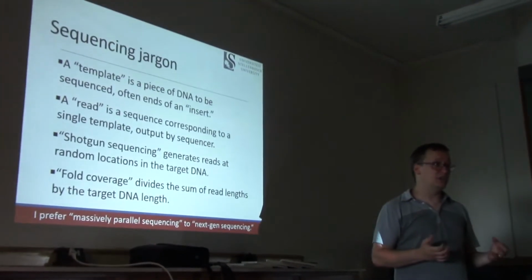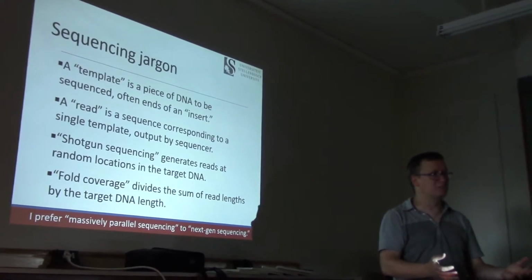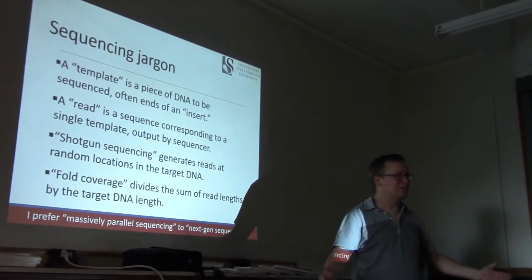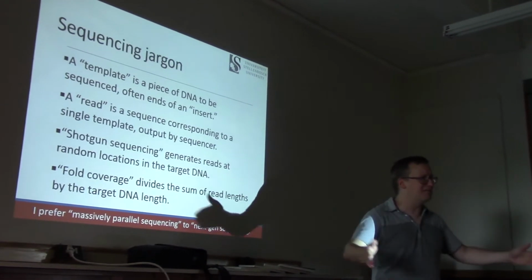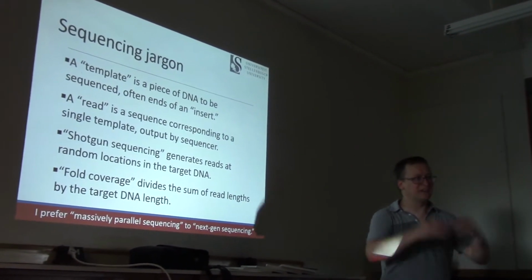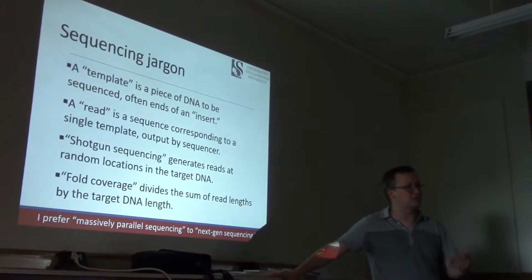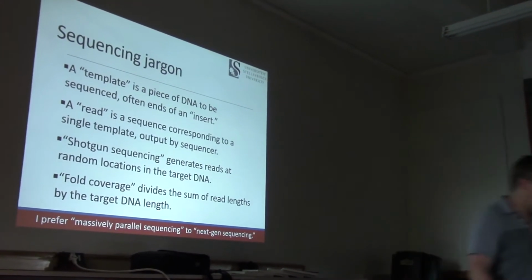That's not very good, because if you do only 2x coverage for an organism, you are not going to have a complete end-to-end sequence for its chromosomes. Generally speaking, someone's going to have upwards of 10x coverage before they have what we'll soon call a scaffold that can cover a whole chromosome. So fold coverage is one of these terms of art that we use to describe how complete the sequencing is that's been done in this organism.